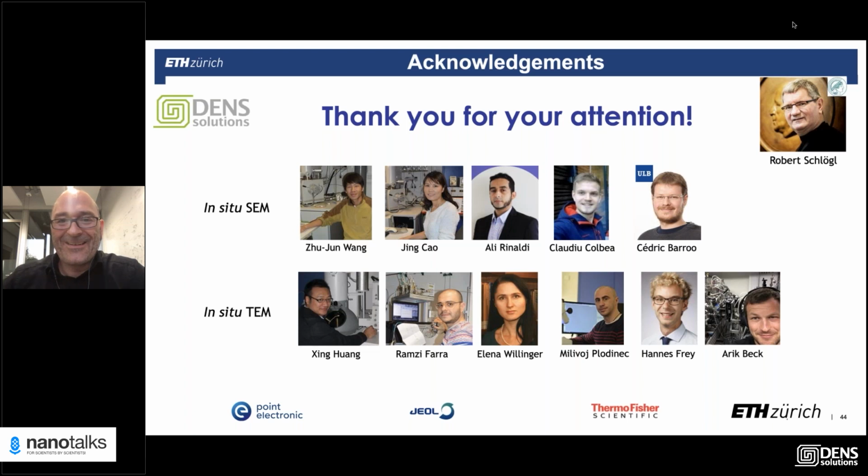And the next question is from Lang Kin from the Ohio State University. Hi, Mark. This is Lang. It's a great talk. I'm not really working in catalysis. I work in chemical looping, which is kind of an indirect catalyst process, so I care more about the final gaseous product. I'm wondering, with the in-situ TEM, can you detect not only the solid evolution, but also the gas product or reactant?